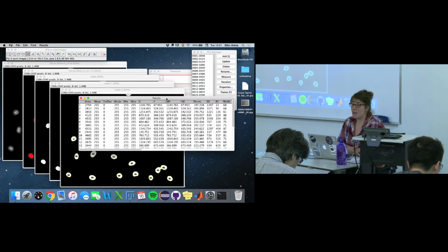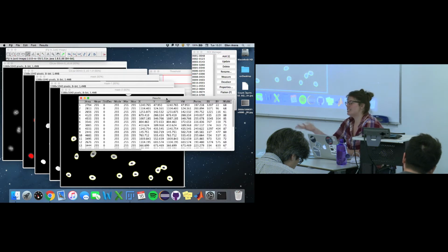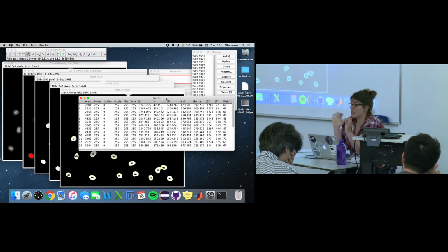Yeah, I did my measurement on my binary image, right? So just like the clown nose that we did before, if you're just interested in area, it's fine, right? It's going to get that information. But I want mean intensity, so I need to overlay my ROIs onto my original data set, just like we did for the clown. Remember, we just toggled the show all?